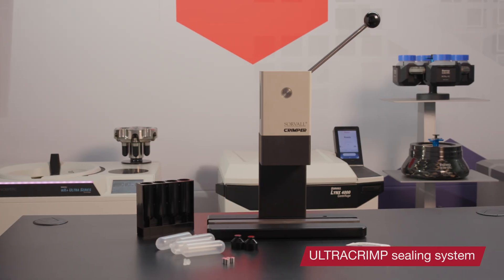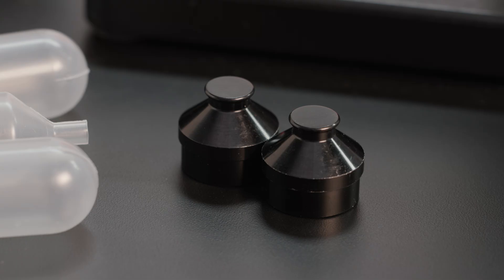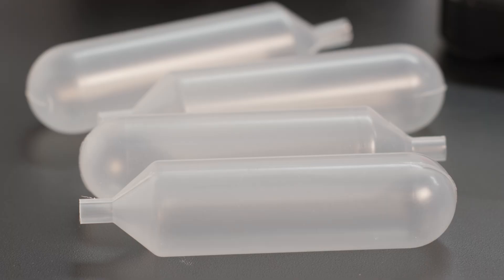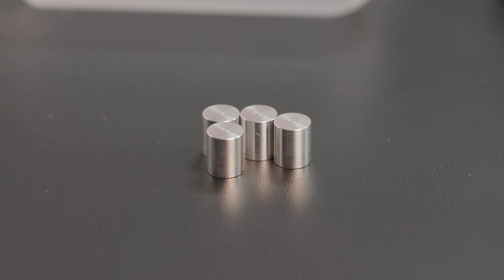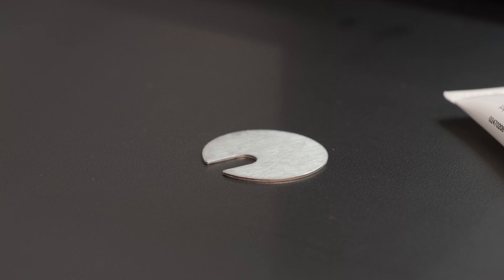The basic ultracrimp system includes the crimper sealing tool, rotor caps, a tube rack, and ultracrimp and clear crimp tubes. Note that the tubes come with tube caps and tube plugs, a tube of lubricant, and a gauge.